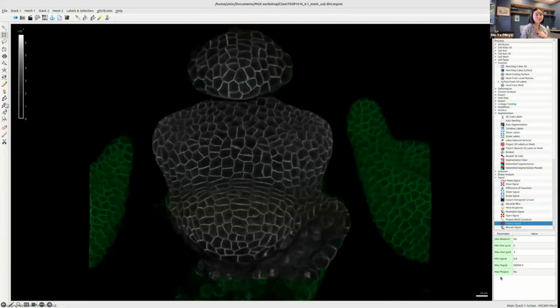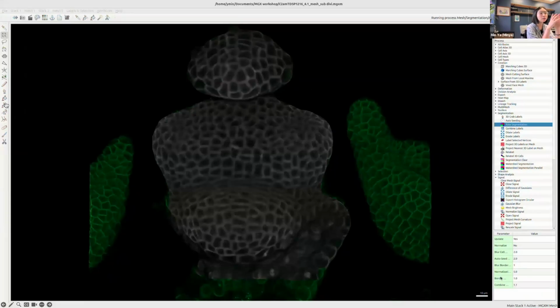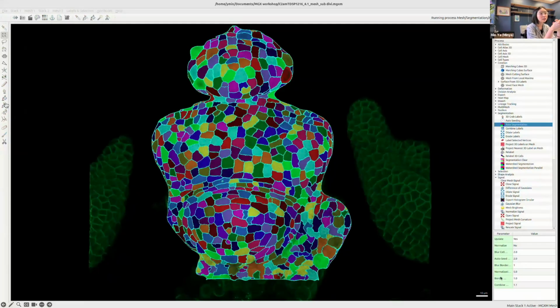We segment the cells. Auto segmentation normally works really well for samples like this, and there are only a few things to change. After I change them and we run, you can see how it's automatically processing blurred and seed of the cells and then segment. And lastly, it will correct a few errors.